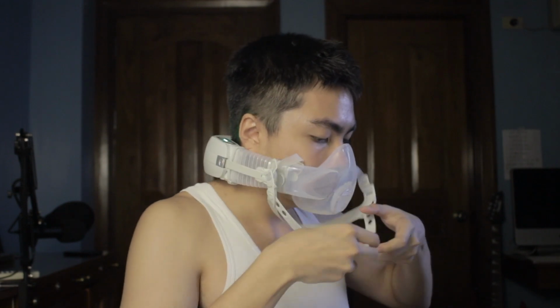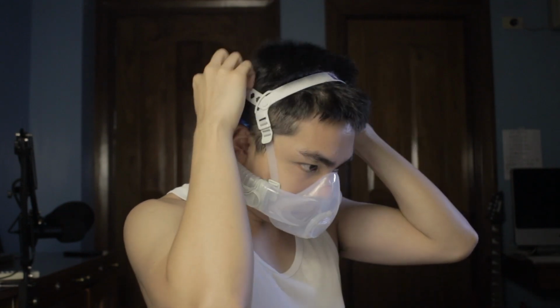Now to don the respirator, make sure you press the power button once to activate it. Then you have to place the blower behind your neck, then fasten the clips. And then pull the mask up onto your face, and then pull the harness over your head. Make sure everything is settled in and adjust accordingly. Also, do check for any leaks, as there shouldn't be any leaks at all.